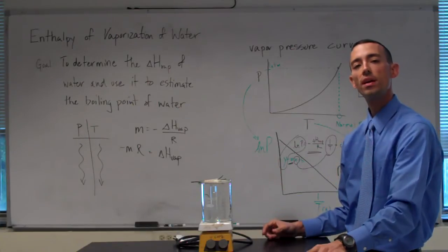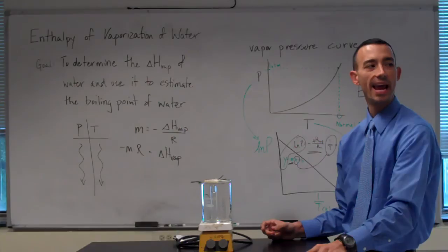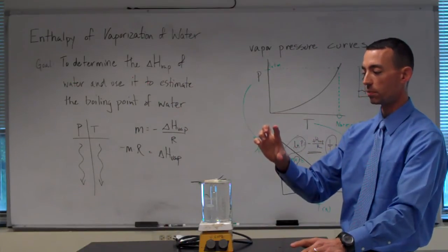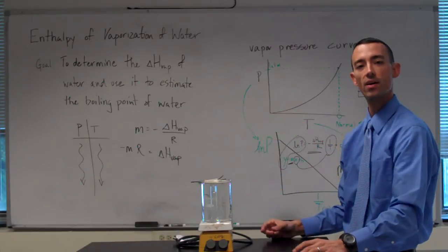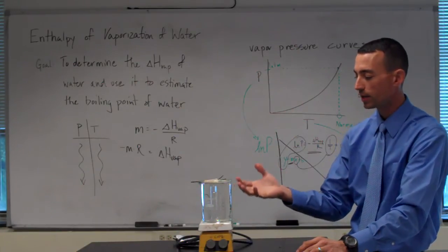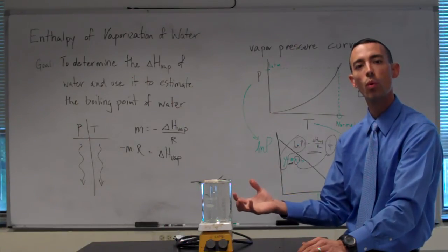Right now, the gas inside that bubble is mostly air, because I just started with the cylinder filled most of the way with water, so it would have been air on top of it. As we heat this up, we will be saturating that vapor space, that head space, with more and more water.